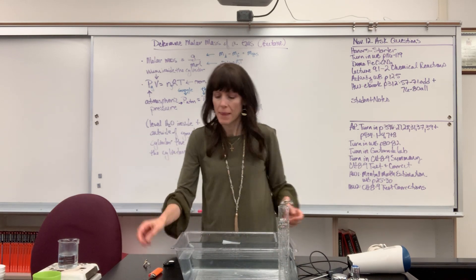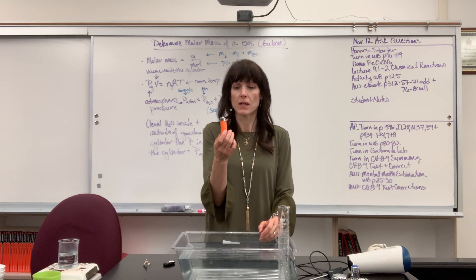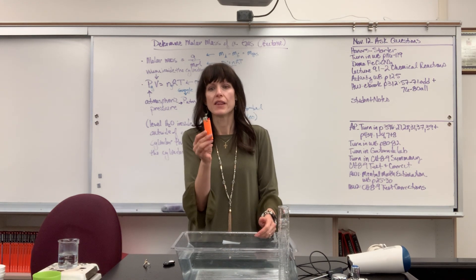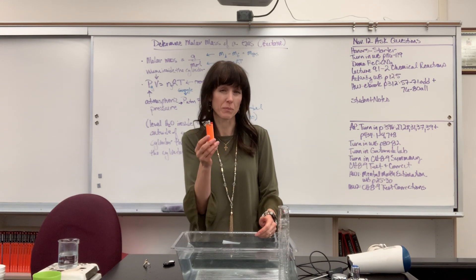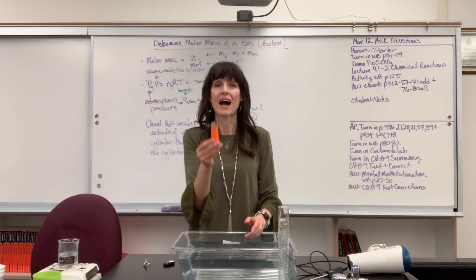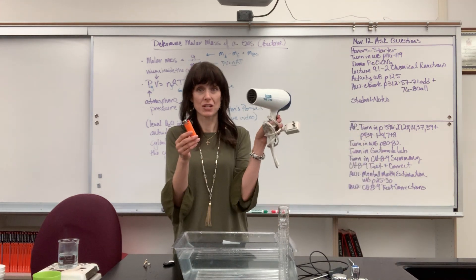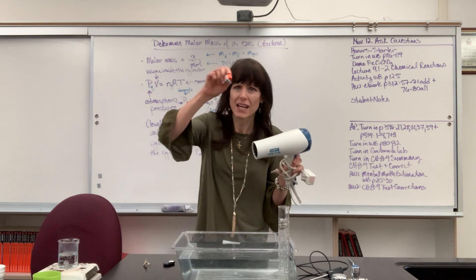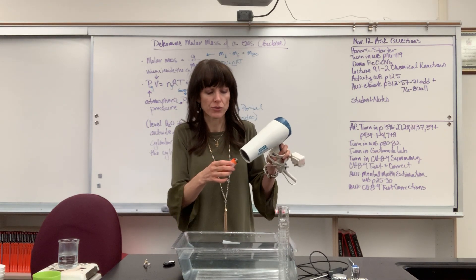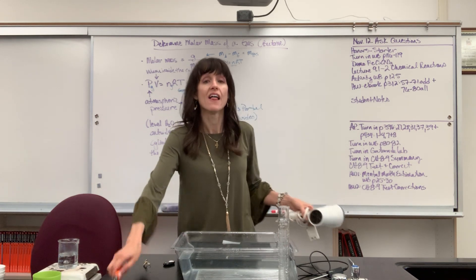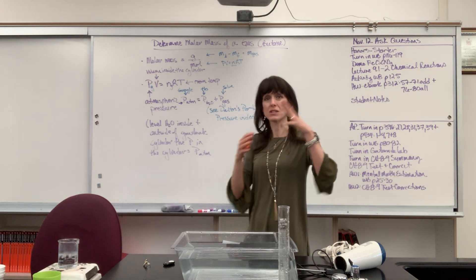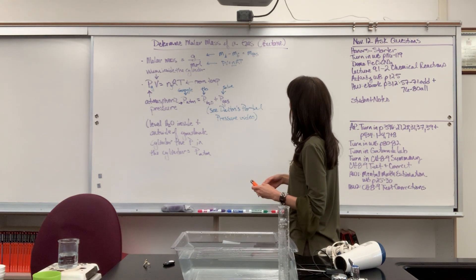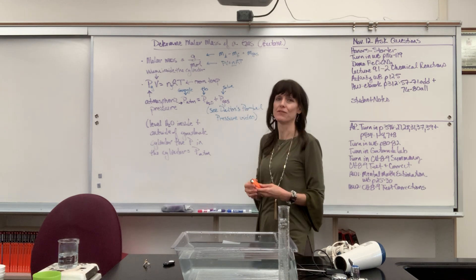One last piece of data: after I put the lighter under the water and released the gas, I now have to weigh the lighter again — but there is an issue, and this is where students make their biggest mistakes. You have to dry this. Get a hair dryer — kid you not — and dry it, dry it, dry it. Let it sit for two minutes, then dry it again. Inside there are little holes and notches; dry those thoroughly. Let it sit and cool, then weigh it. That final mass will be less because you just released about 80 mL of butane gas. Subtract to get the mass of the gas.